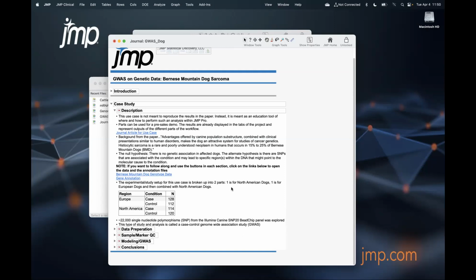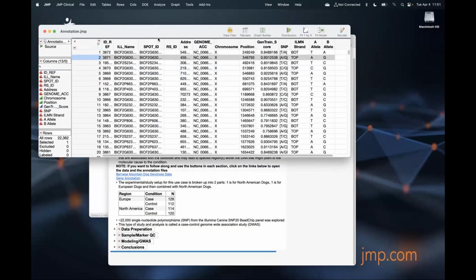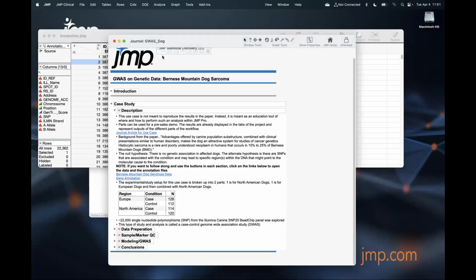So we've got a large number of things to look at, and the article set it up as, let's look at these things independently, and then let's look at them combined. So we can kind of do that if you like. We'll look at those that are independent at first. Some things that we'll need. This one's not too bad. I just got the annotation downloaded. This came from GEO's website. So I did that.